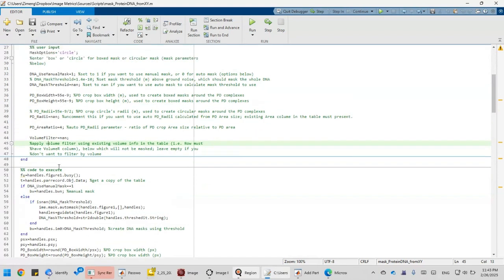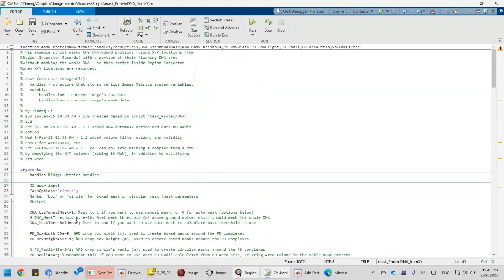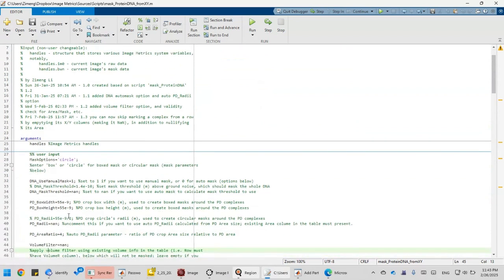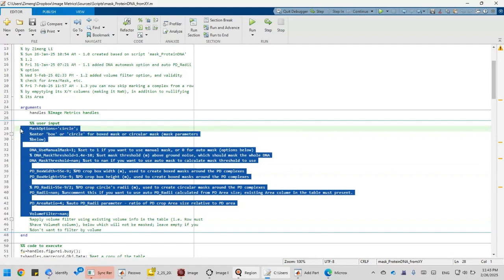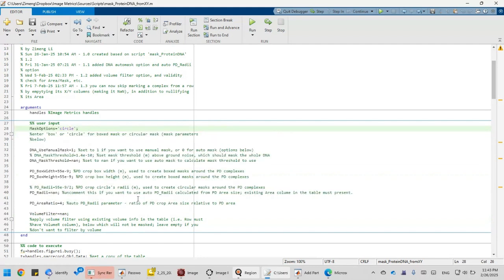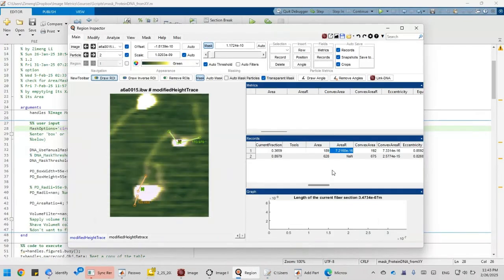And then, yeah, we don't need to care about the rest. That's just the code that I use to calculate all this stuff. So these are the parameters that the users care about or need to change for their script. And once you have these parameters predefined, you can simply run this script by right-clicking these and clicking this profile.